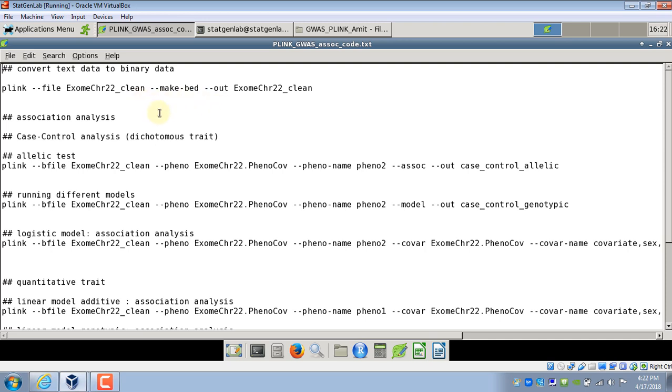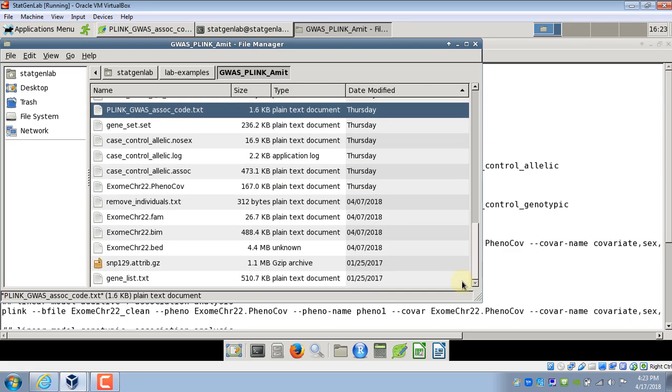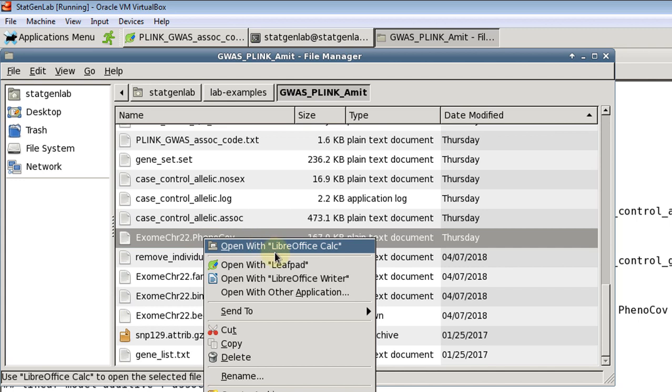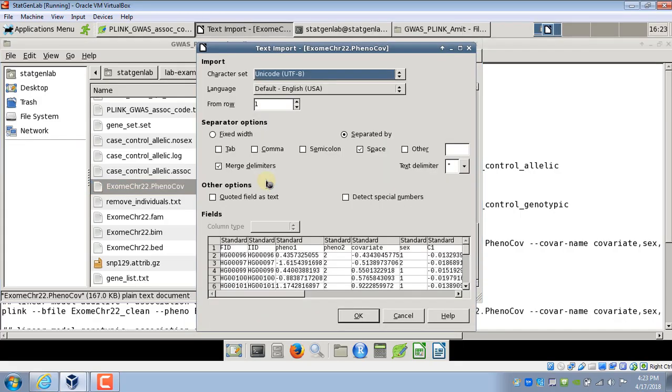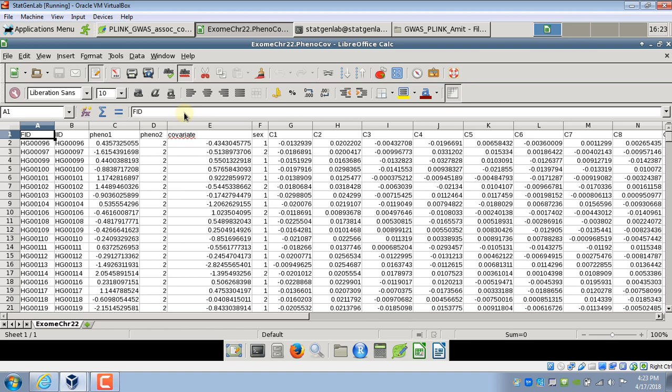In this analysis I am going to use a separate phenotype file. So we have a third file apart from ped and a map file and that file is called exome chr22 dot pheno cov. So I'll show you how that file looks like. Now this file includes phenotype as well as covariate. So this file is a text file although I opened it in Excel-like software but this is a text file.